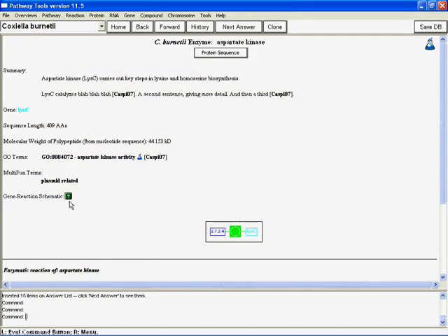So let's put in this citation again. I know naturally a real entry will probably have multiple paragraphs if there's a lot of detail, without the same thing cited over and over and over again. But let's hit OK. And so now we have lysC catalyzes blah, blah, blah. We have our first sentence here.